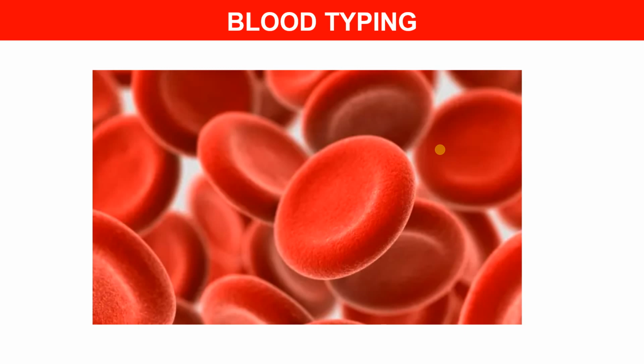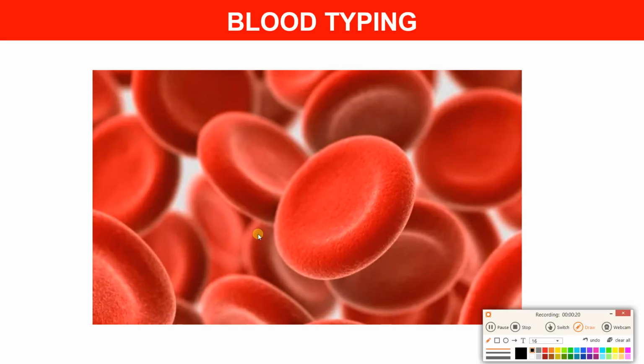So, what kind of formed elements do we see here? You should definitely know these. These are red blood cells. We can see their biconcavity that they've got going on here. Definitely red blood cells. Super abundant cell in our blood, super abundant cell in our body.